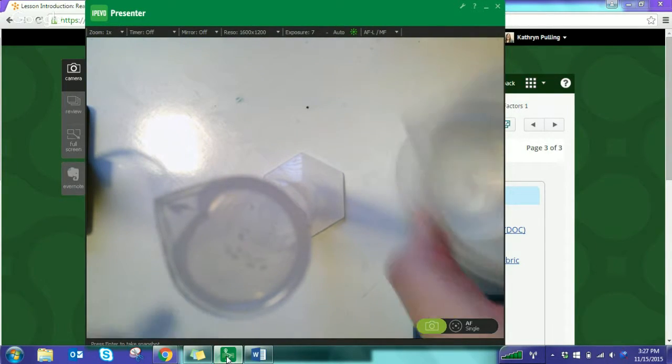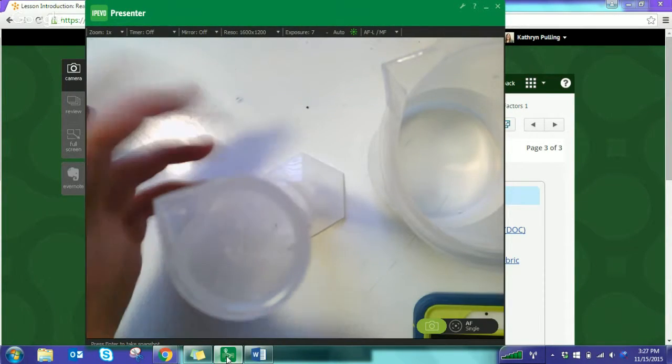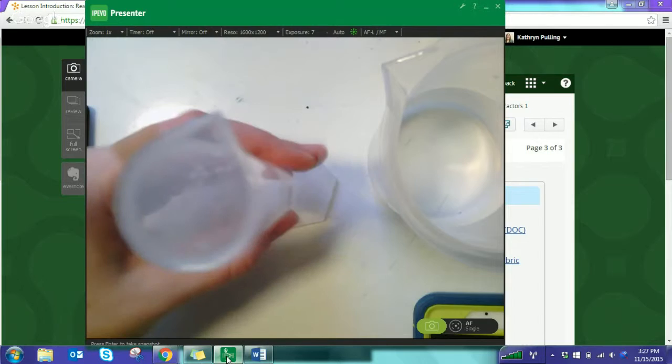then I'm grabbing my beaker that has water. All right, ideally, you're using distilled water. If you don't have distilled water, purified would be better. Tap would be fine, but that may cause side reactions. All right, so whatever you have, use, but if you have distilled, that would be best.